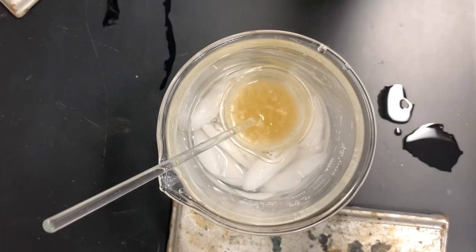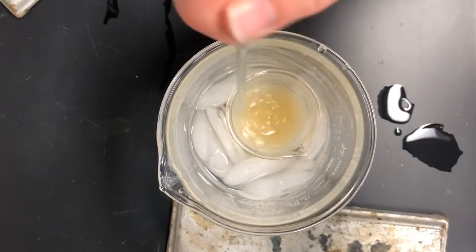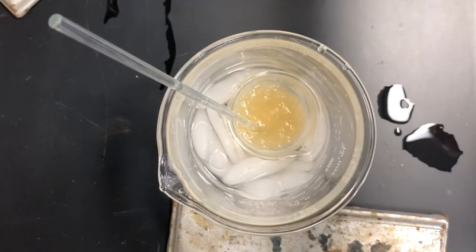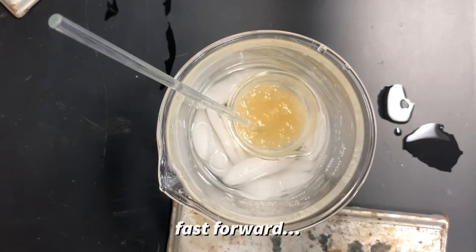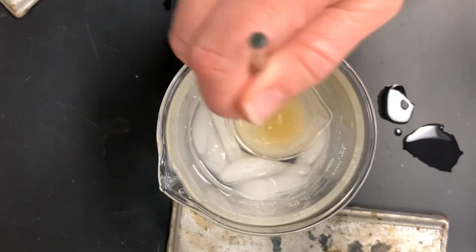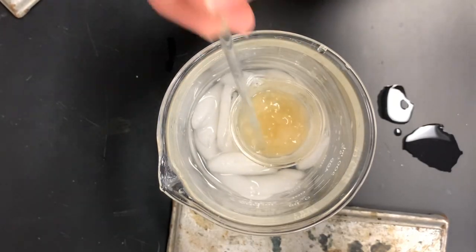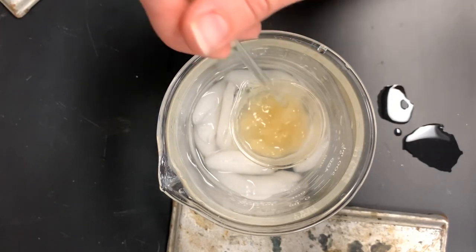You can see how it's starting to get a little goopy in there — that's the soap molecules starting to come out of solution. Stirring the mixture can help disturb the solution and help more precipitate fall out of solution.